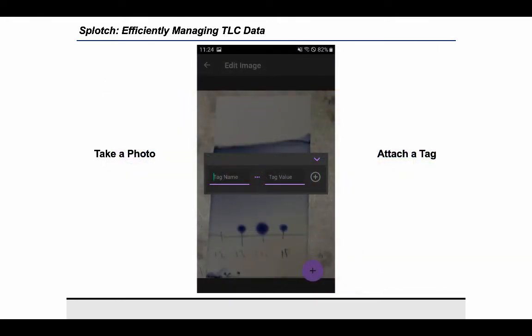Start by taking a photo of your TLC and giving it a tag. This could be the name of the experiment, the solvent system that the TLC was run in, or the stain that it was developed in, for example.